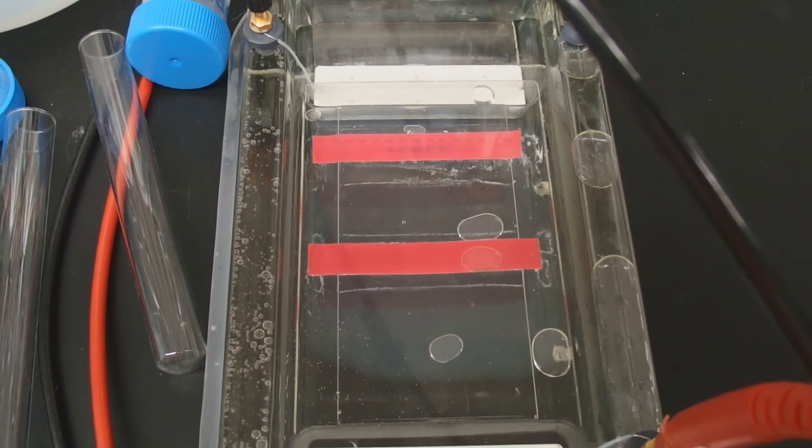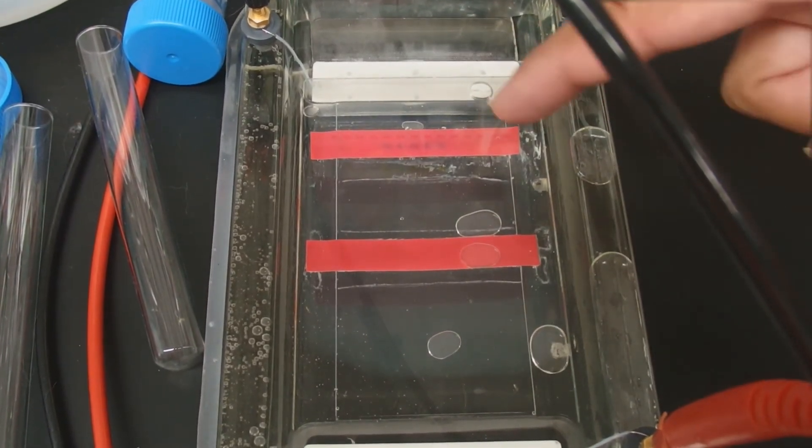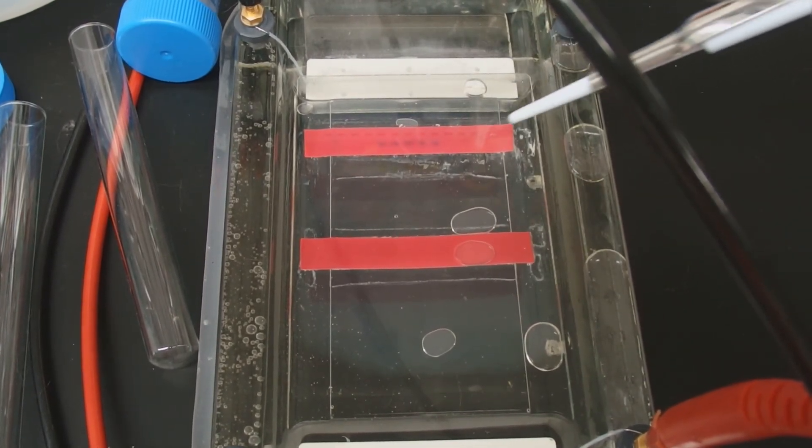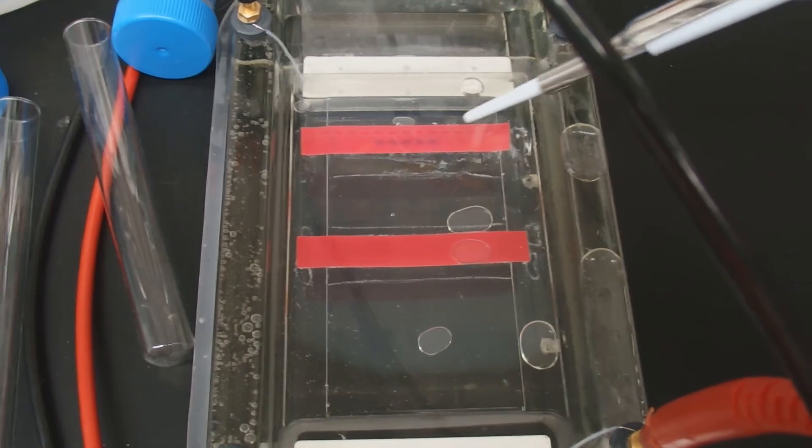That's how you know your agarose gel is running. You'll also notice that right here your DNA loading dye is moving. So we're getting the blue or the green colors moving.